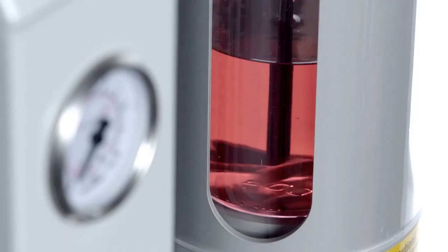An integrated magnetic stirrer ensures a homogeneous distribution of the particles whilst the measurement is in process.